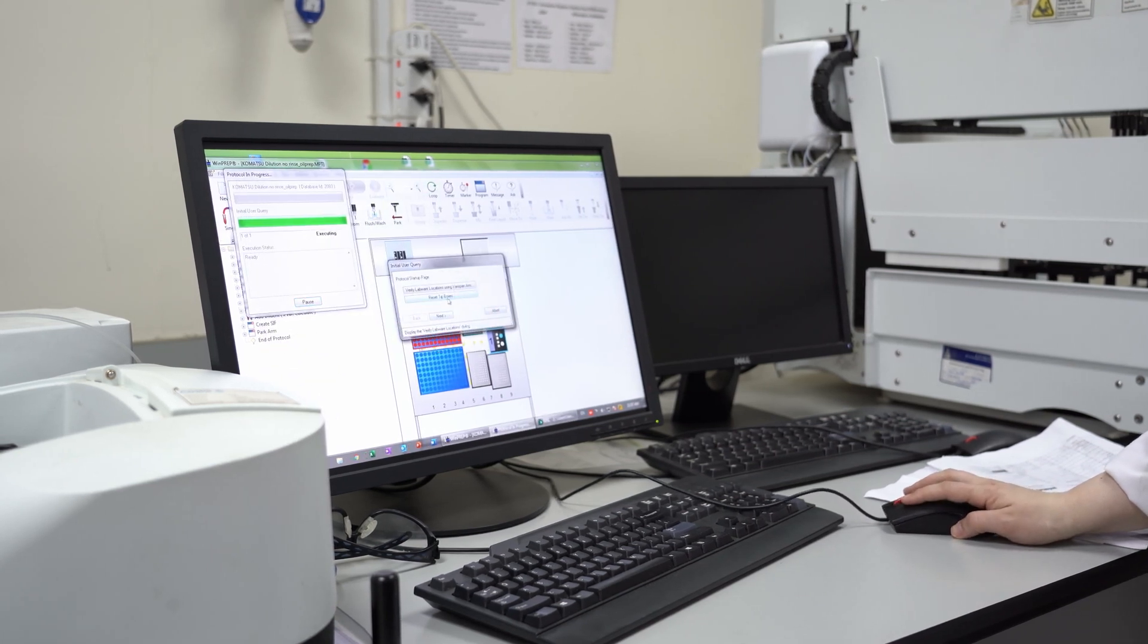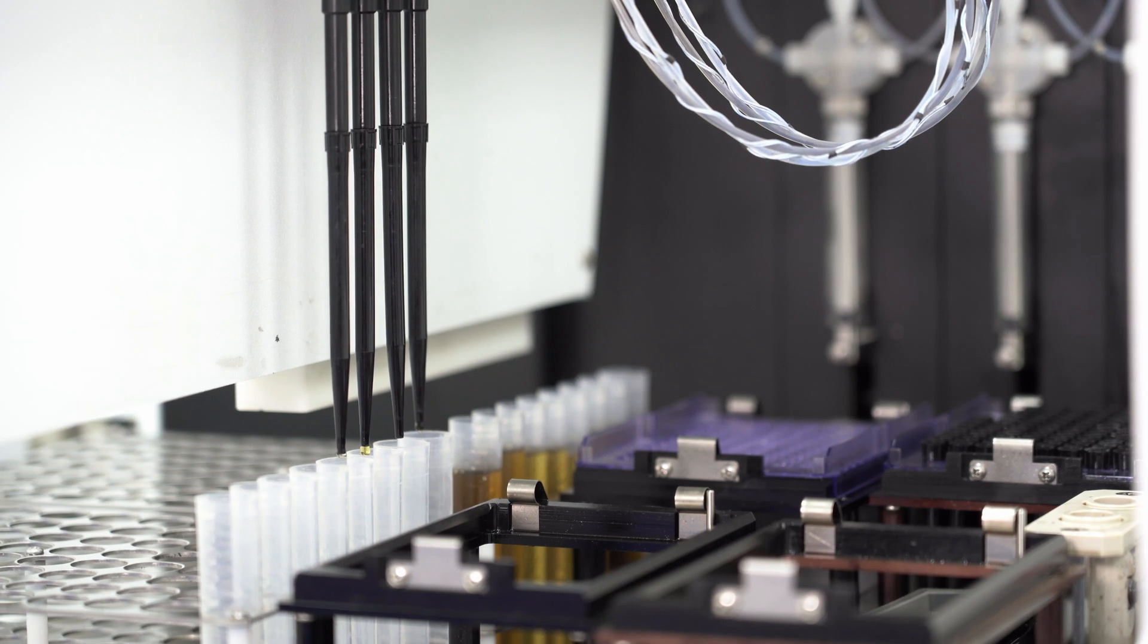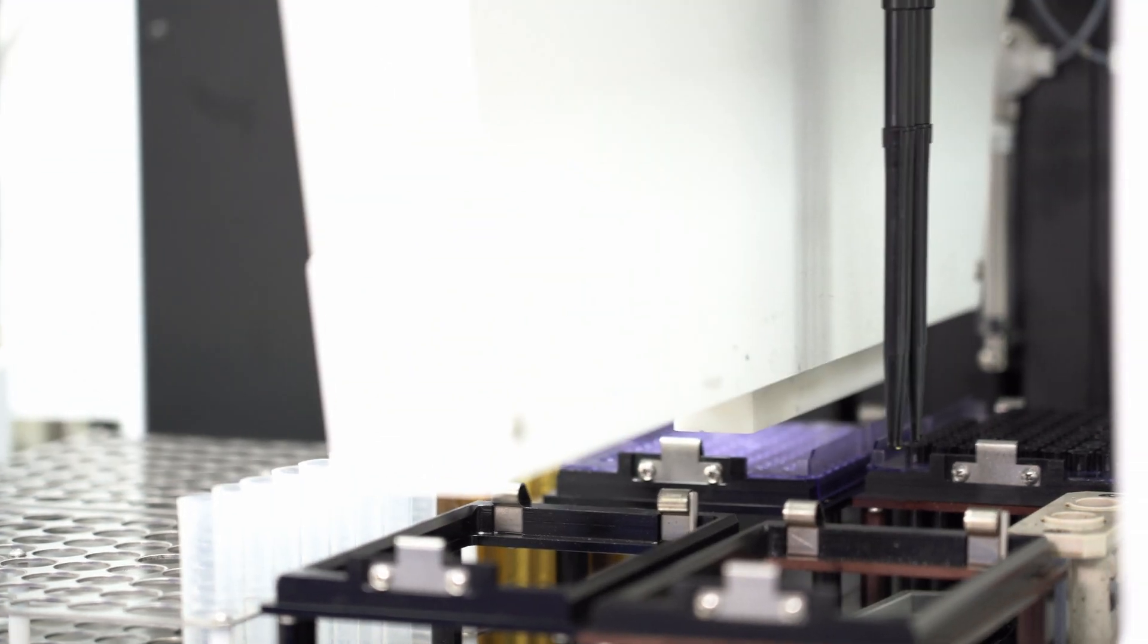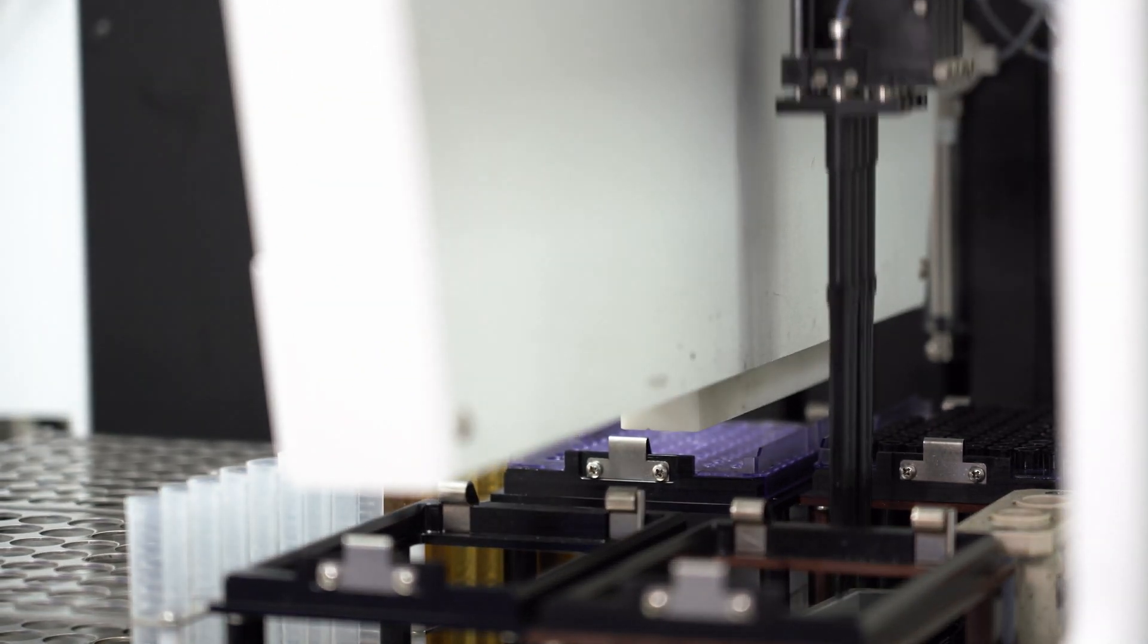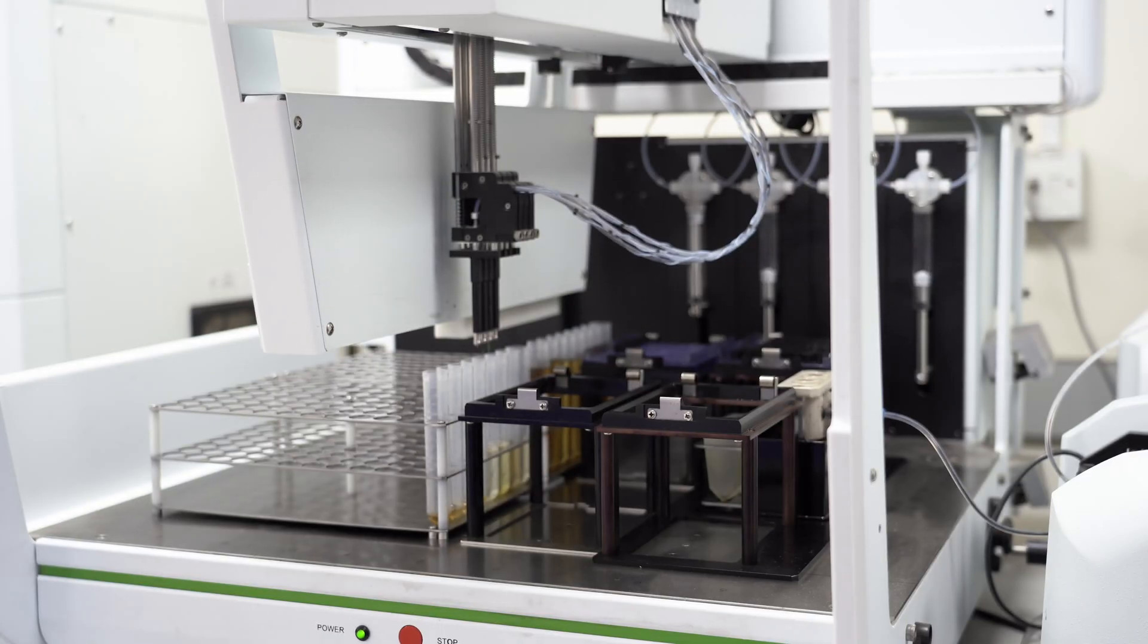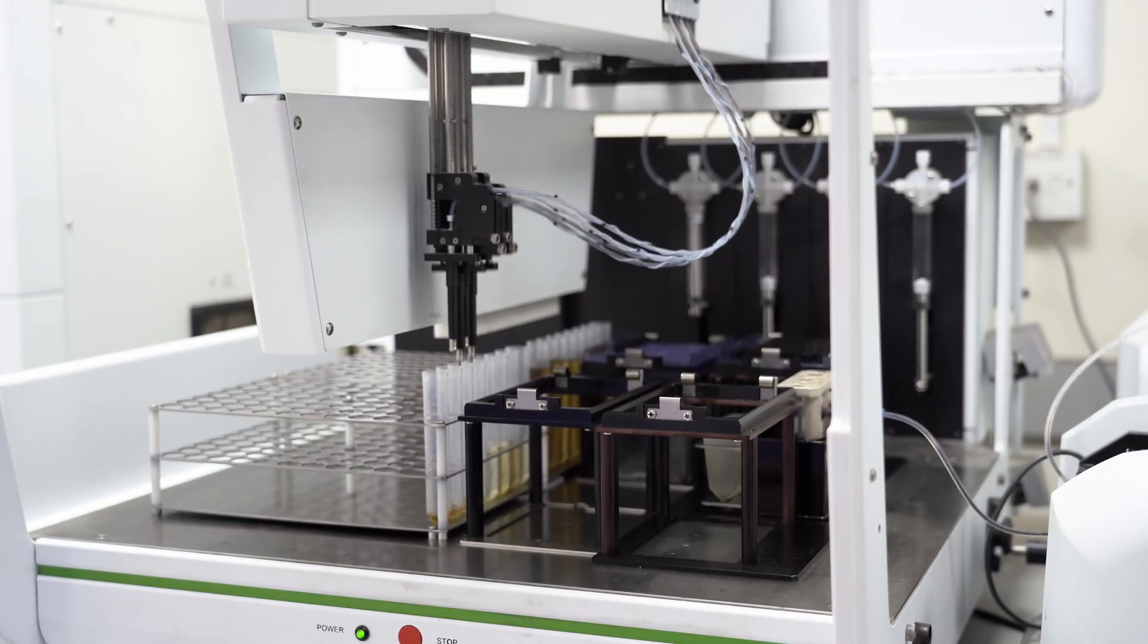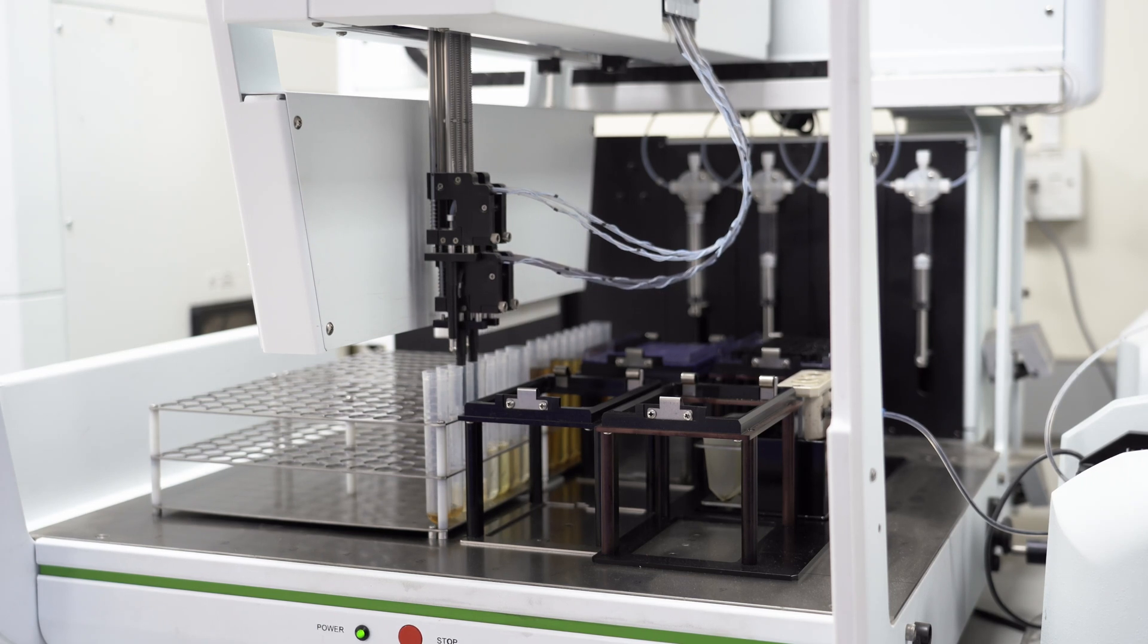Oxidation is a chemical reaction that occurs when lubricants react with atmospheric oxygen, resulting in the formation of organic substances such as acids and esters. Products of oxidation could increase the viscosity of lubricants and can be responsible for an increase in wear elements.